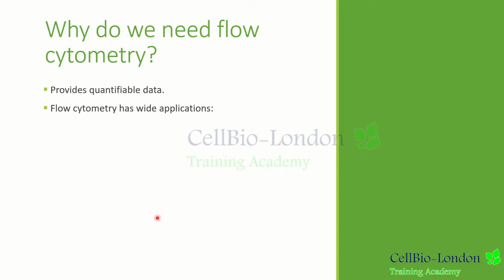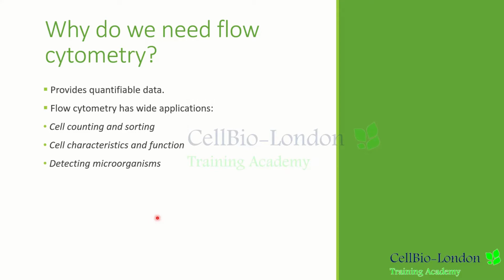In general, it is routinely used in basic research, clinical practice, and clinical trials, such as cell counting and sorting, determining cell characteristics and functions, detecting microorganisms, biomarker detection, diagnosis of health disorders or diseases such as blood cancers, and even protein engineering detection.